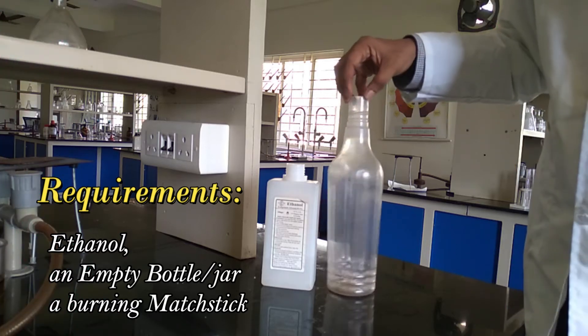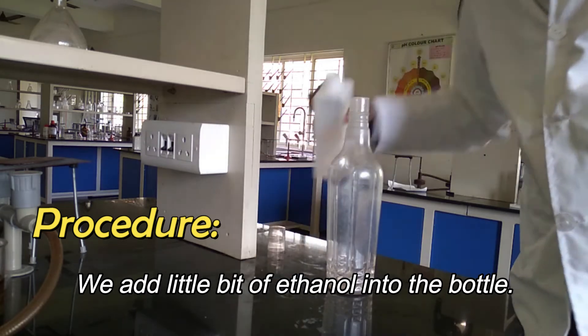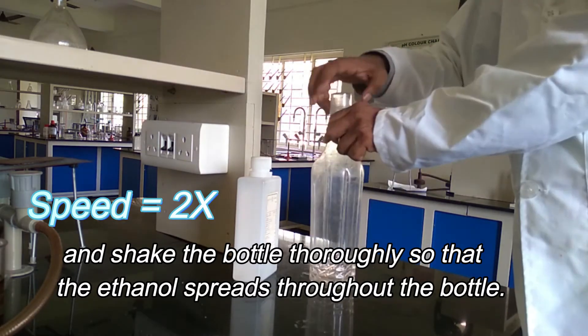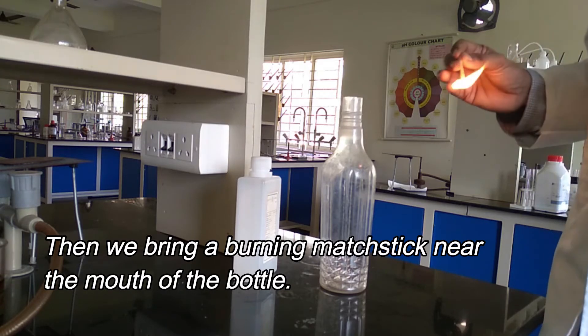We require ethanol and a bottle. We add a little bit of ethanol into the bottle and shake it thoroughly so that the ethanol spreads throughout. Then we bring a burning matchstick to the mouth of the bottle.